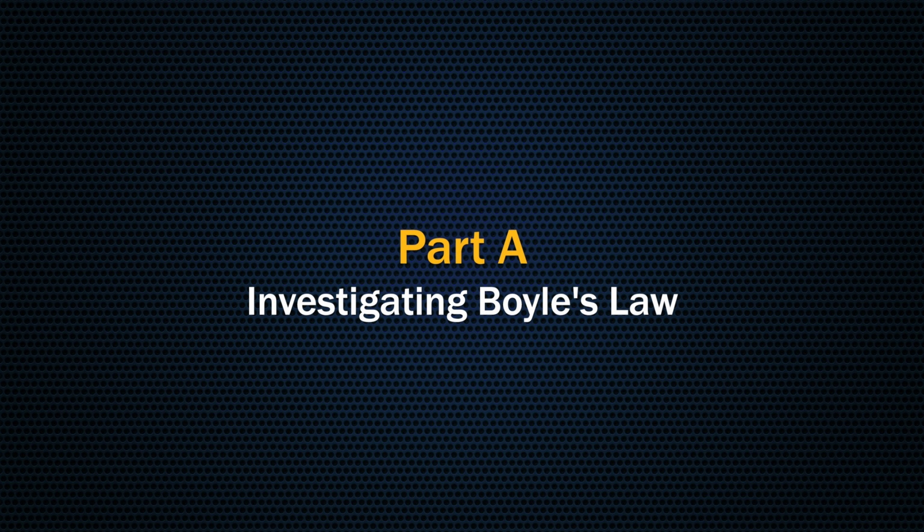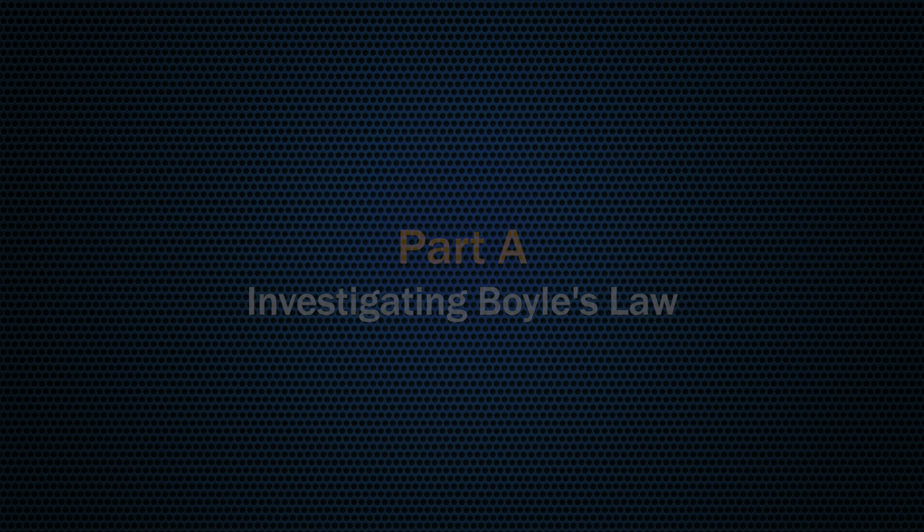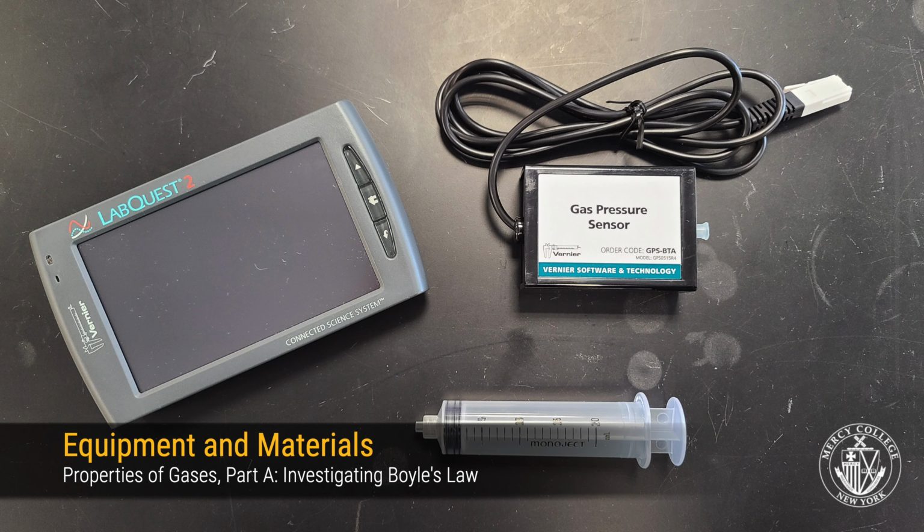In part A of this experiment, we'll investigate Boyle's law and see how the pressure of a gas responds as we expand the volume. Here are some materials that we'll need in part A of this experiment.